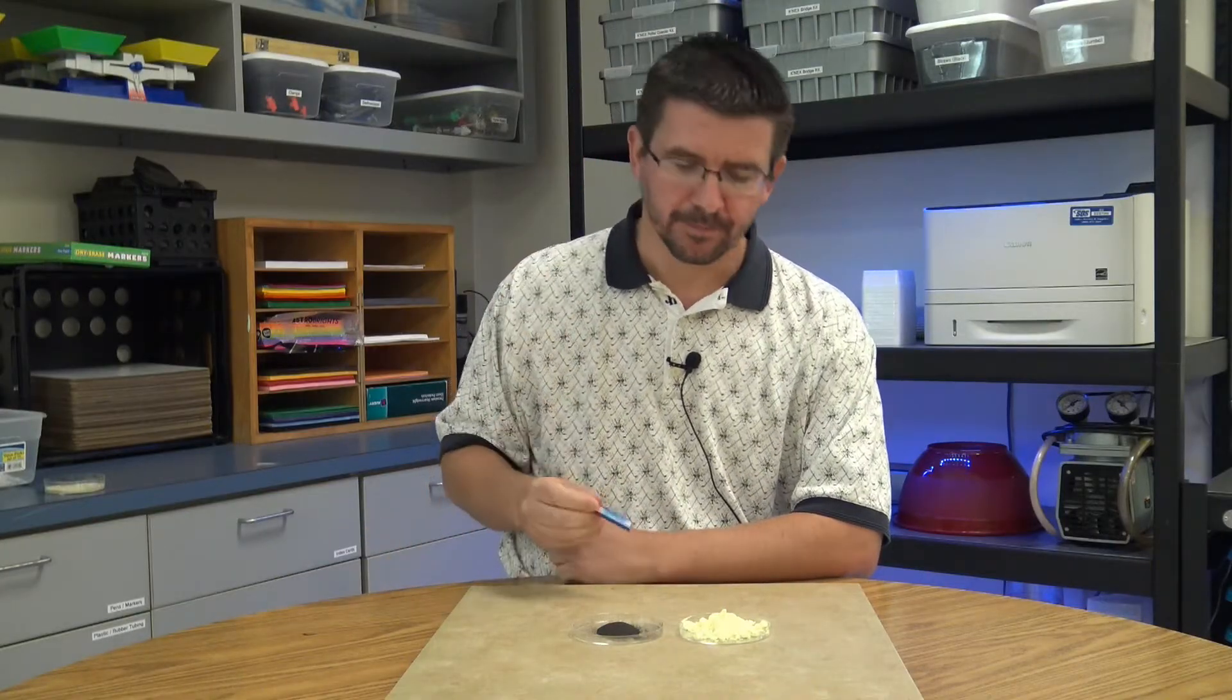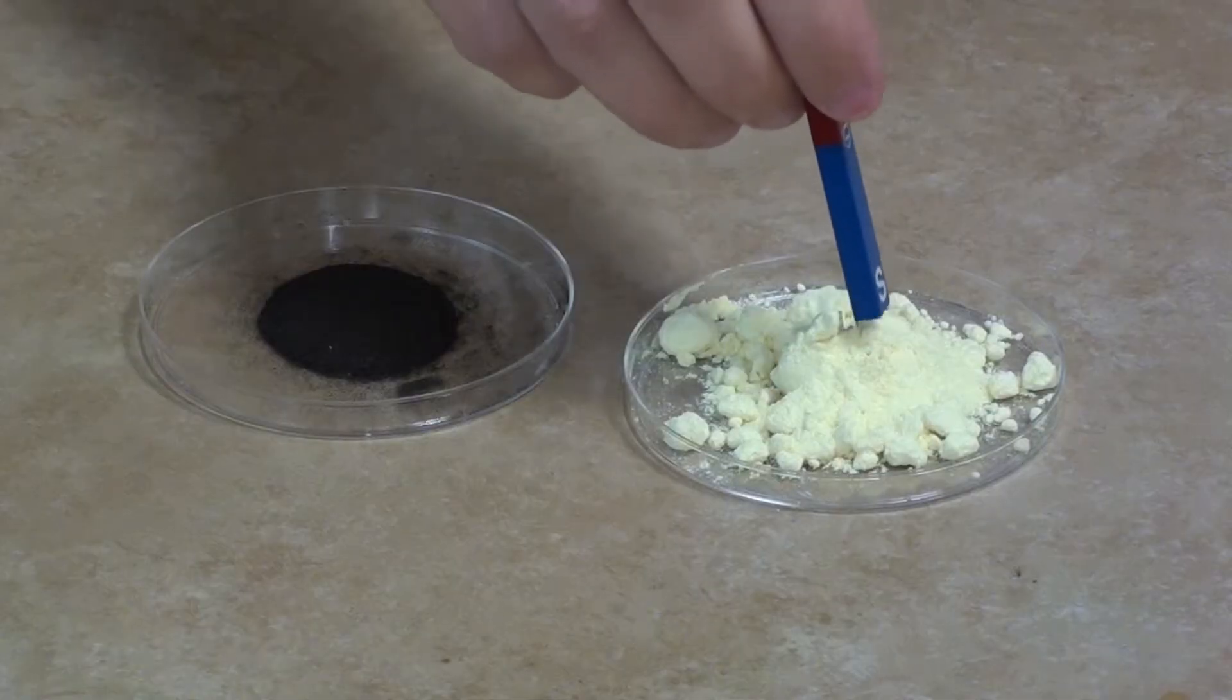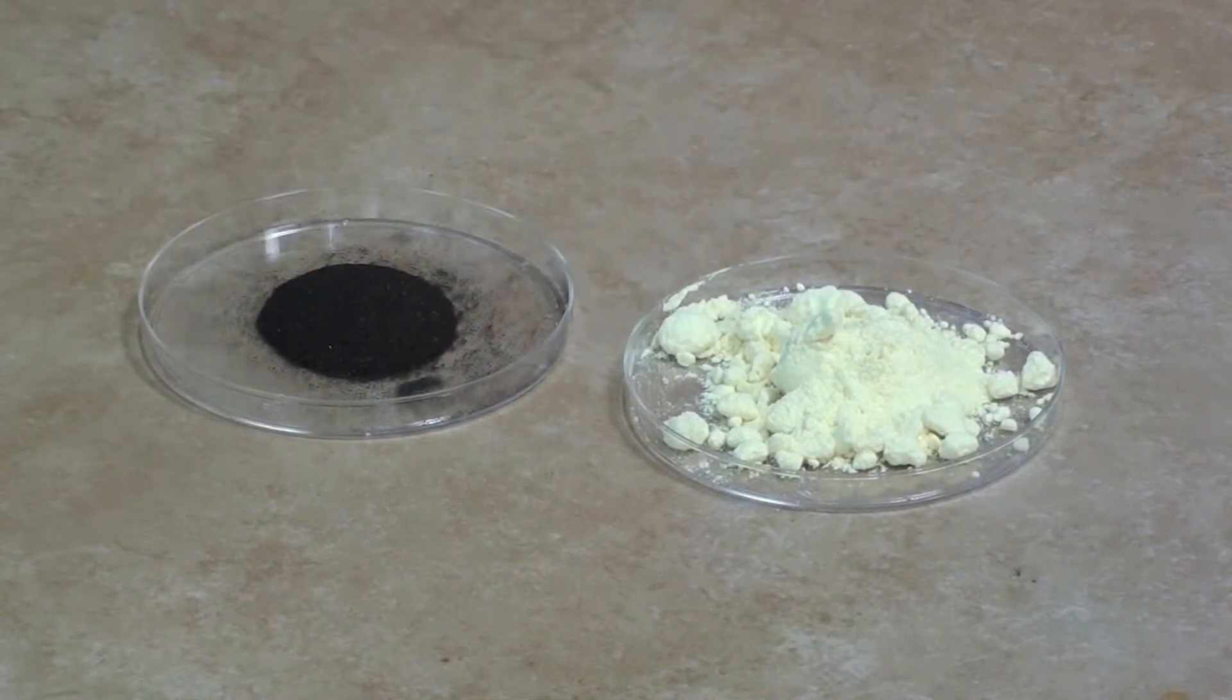One of these is a ferromagnetic material but the other is not. Hopefully from our previous lessons you know that the ferromagnetic material is the iron. But to test that we can use our little bar magnet here. If I put this near the sulfur you can see that the sulfur is not attracted to the magnet.